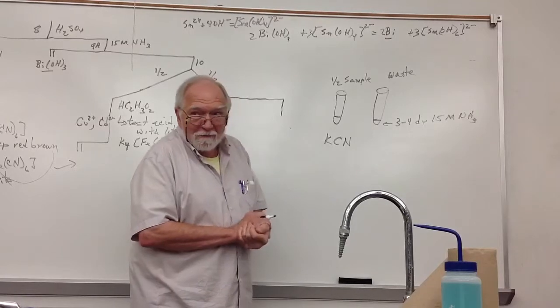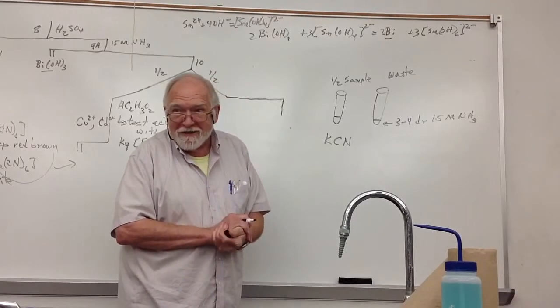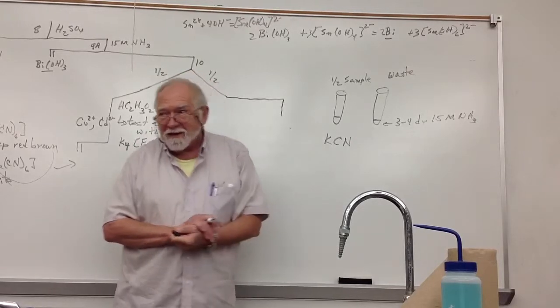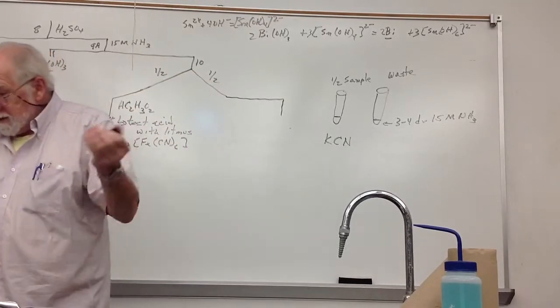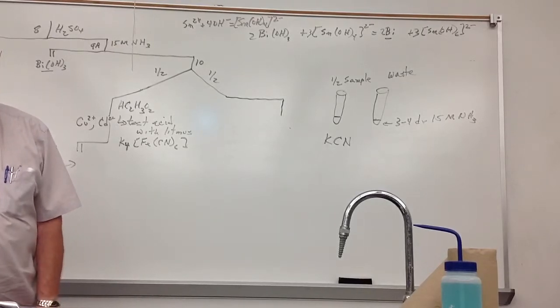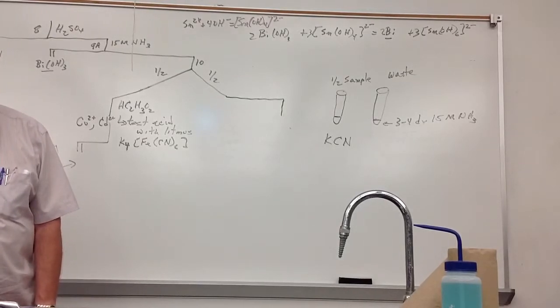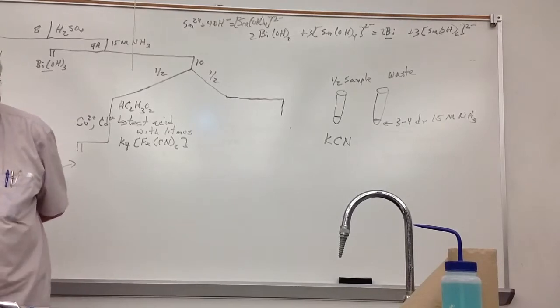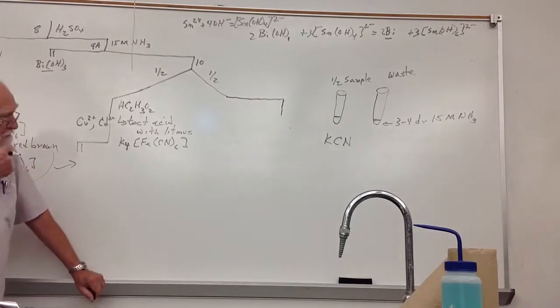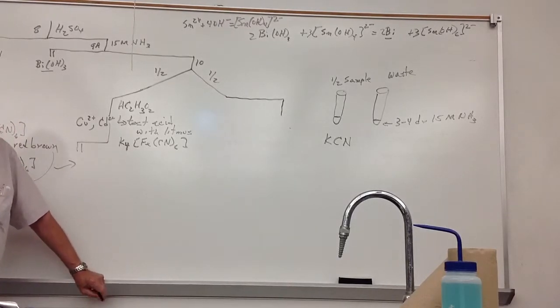And if it doesn't turn blue, the first thing I'm going to ask you to do is go back and add some more 15 molar ammonia. Notice I do this thing after our exams and everything, and I'm still here because I don't take any chances with it. I make sure it's basic before I add cyanide. I'm the one that's closest to it when I add the cyanide. Right? So don't try to poison me because it won't work.